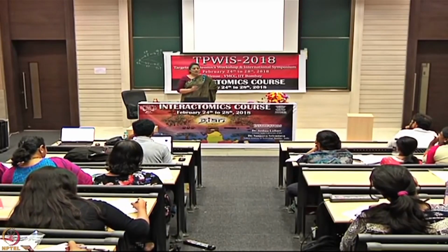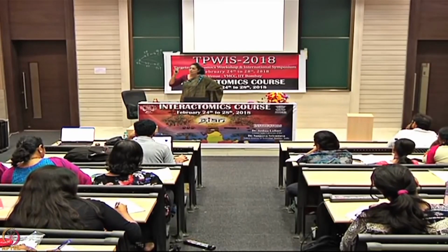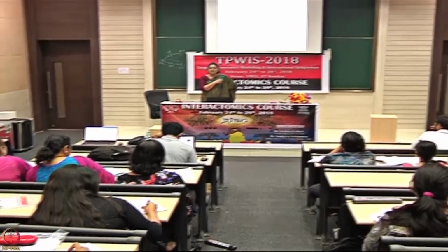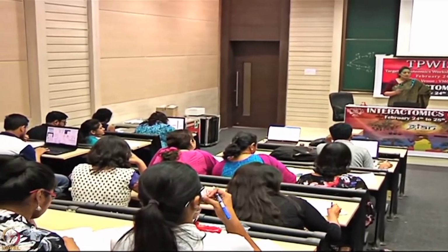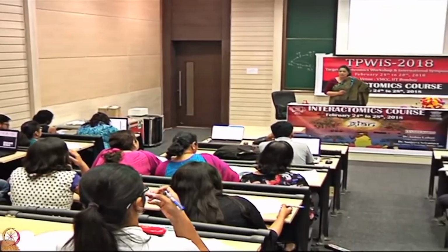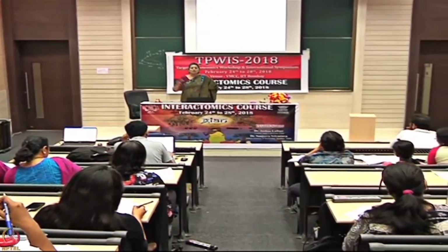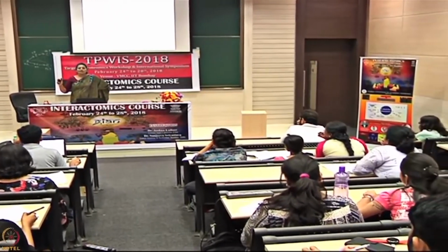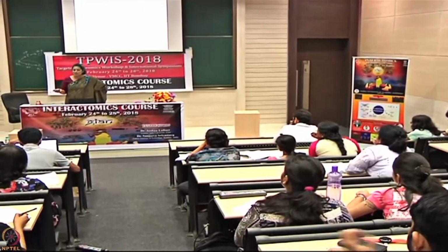Okay? So when you're doing SPR, you be careful about all these things. Your calculations, you first do predetermined calculations. You go back and look at your sensorgrams and see whether you've got all these values correct. You estimate the equilibrium dissociation constant, even if you can't get the kinetics, and find that your binding interactions are very similar to what you have obtained by other studies. It is better to do SPR after doing some kind of measurements that tell you the equilibrium constant.